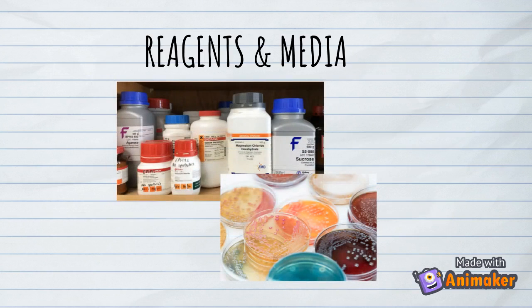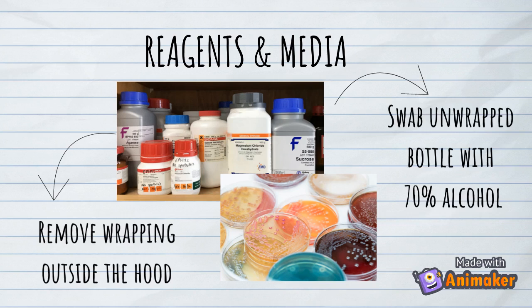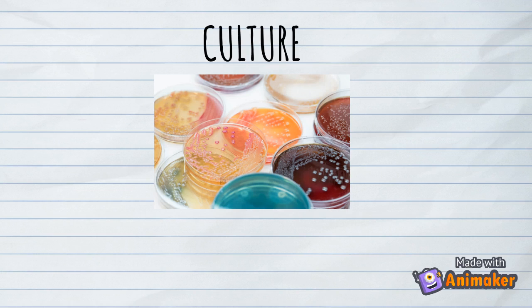The fifth element of aseptic environment is the reagents and media. The wrapping should be removed outside the hood, and unwrapped bottles should be swabbed in 70% alcohol when they come from the refrigerator or from a water bath. And lastly, the element of aseptic environment is cultures.